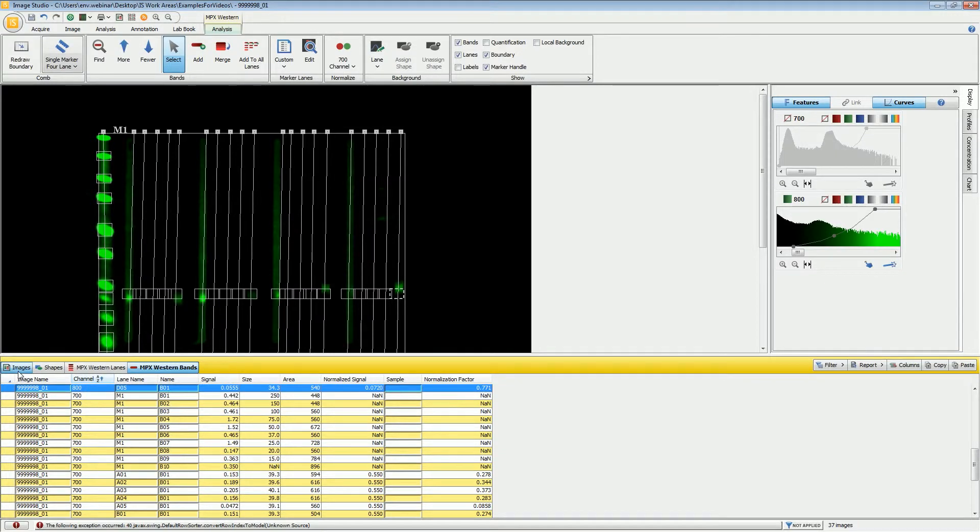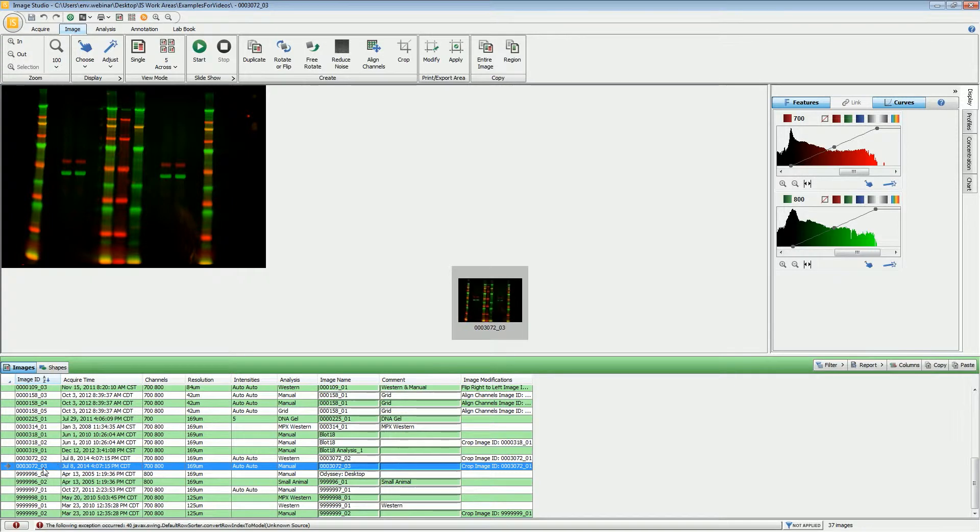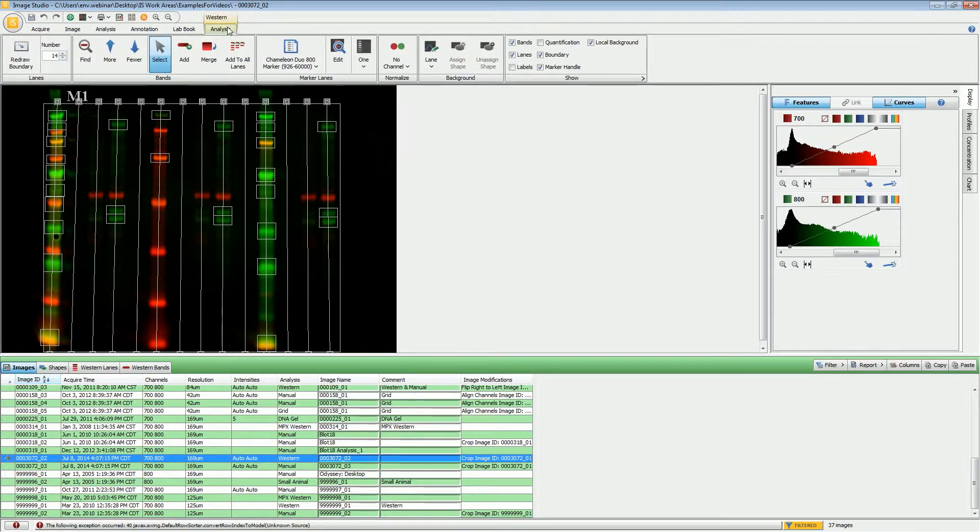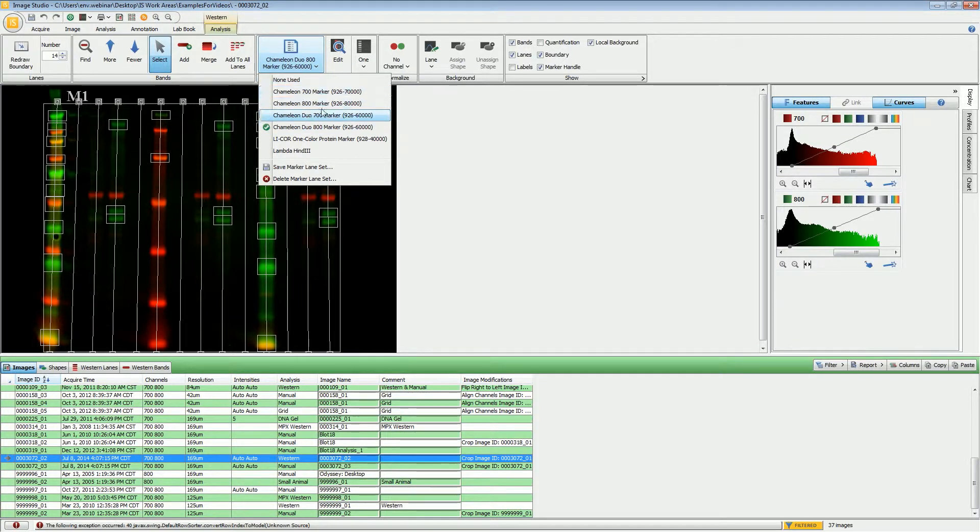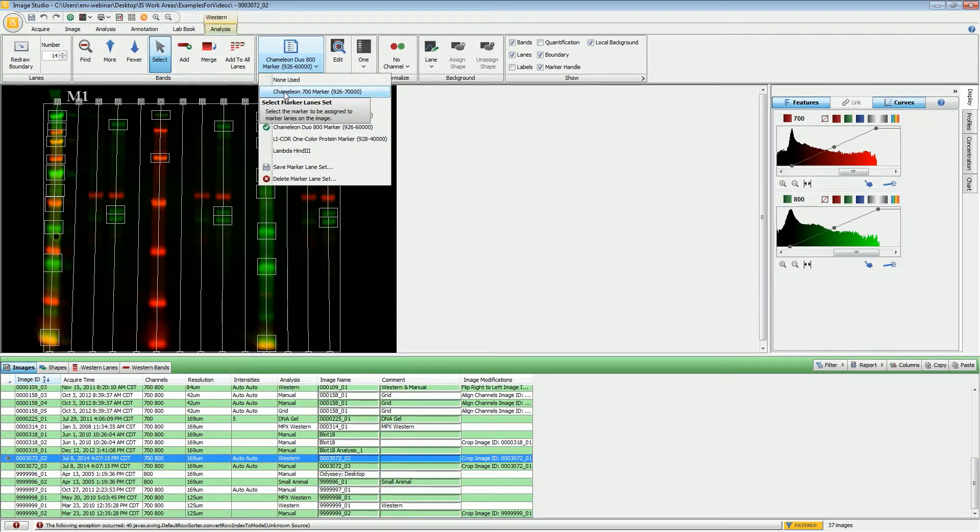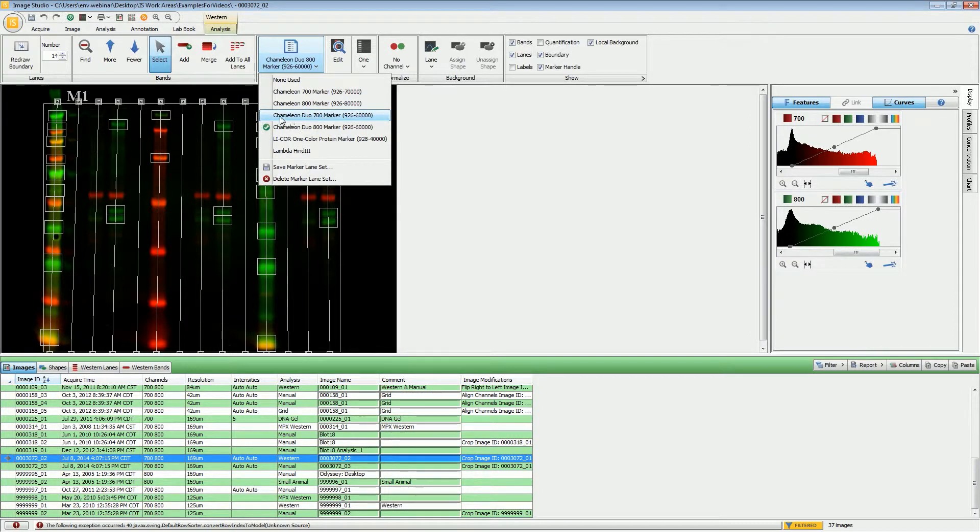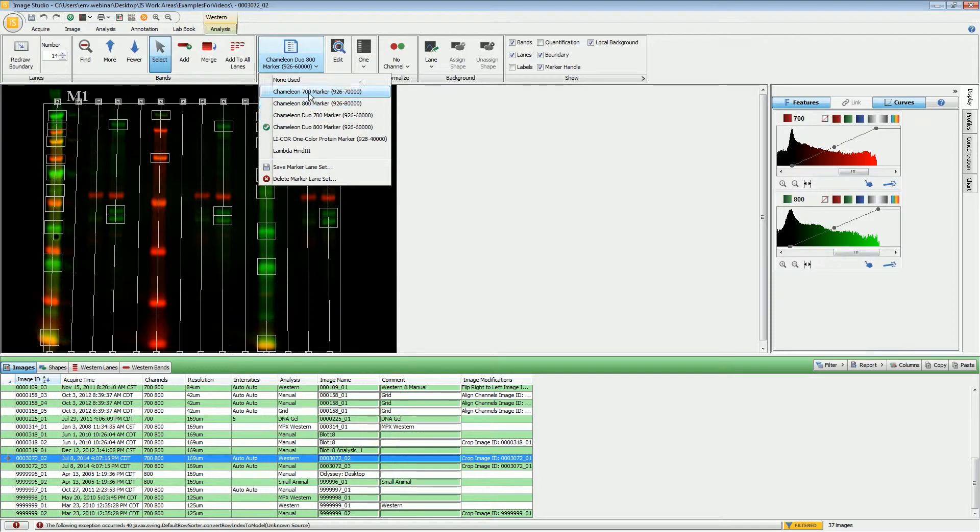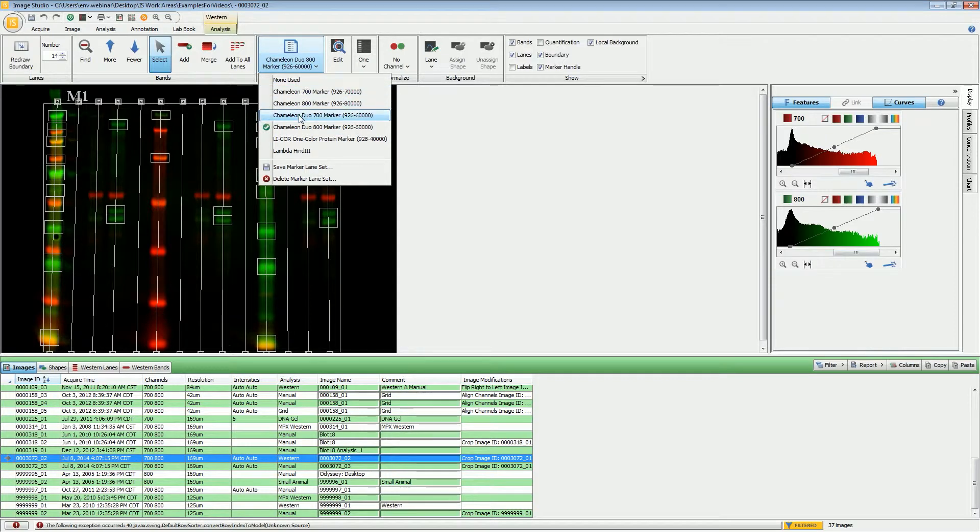Now for the chameleon markers, I will need to switch to a different image. This is a basic Western analysis, but the process is the same for using the chameleon markers. What you will need to make sure is that you choose the correct marker. If you will be doing molecular weight sizing for the 700 channel, you will need to choose either the chameleon 700 marker or the chameleon duo 700 marker, depending on which one you loaded. The difference is that there is one extra band in the duo marker compared to the single color, so you do need to make sure that you choose the correct one.